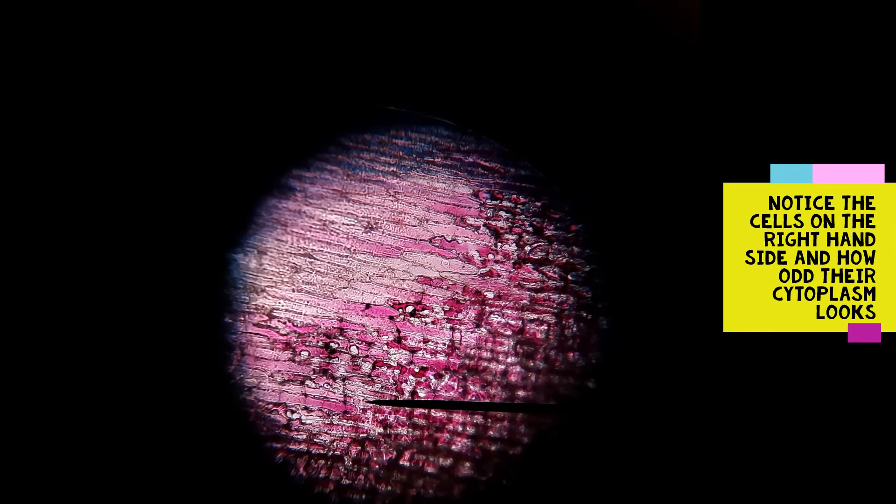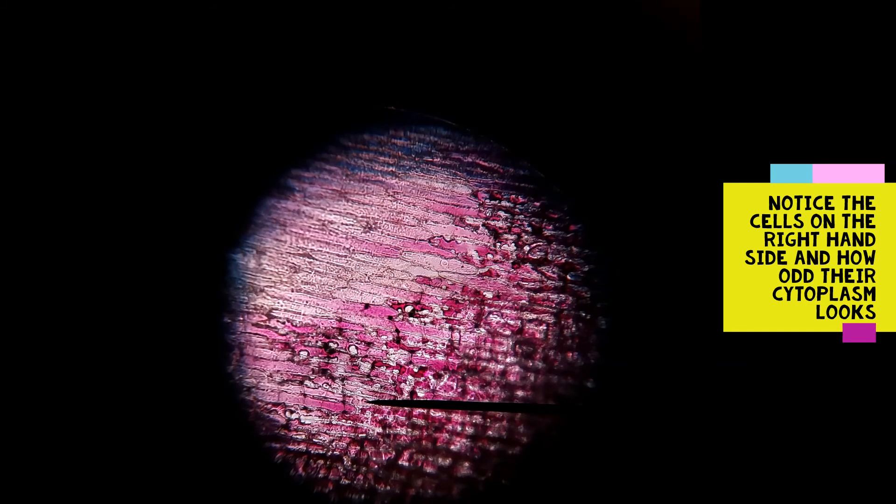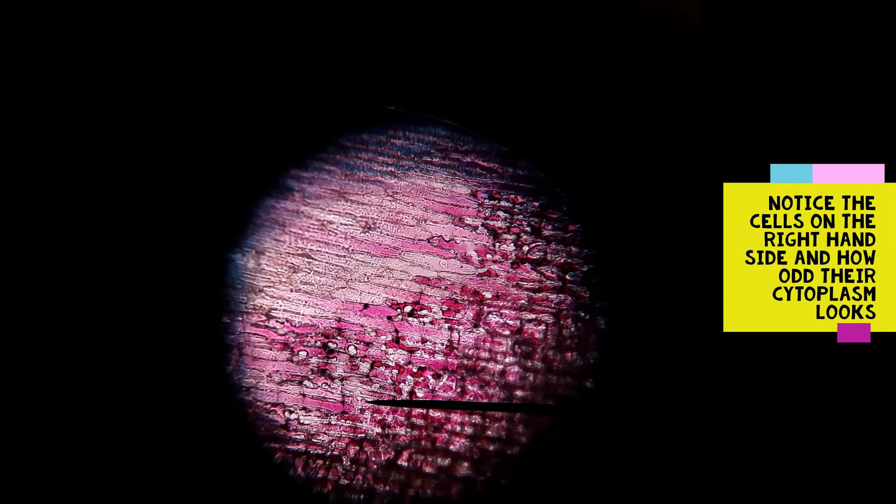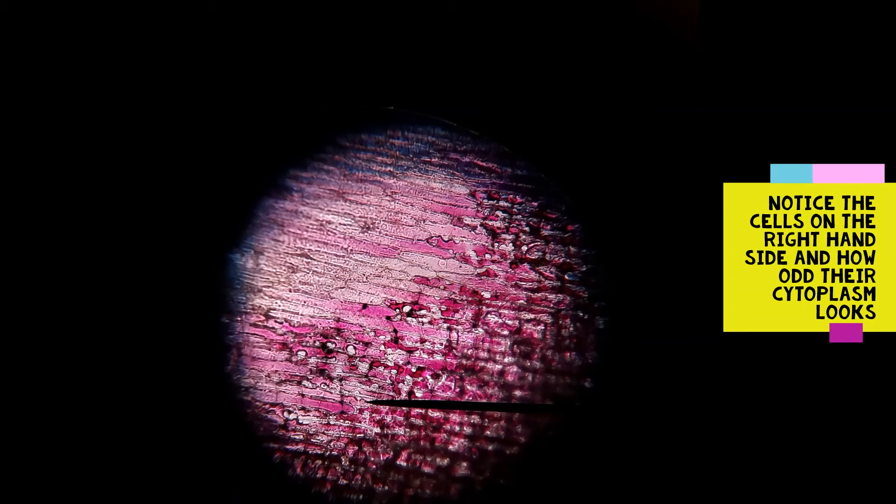So as you can see, as the salt water makes its way across, it makes all the cells along the way become more plasmolyzed. So you can see these white bits starting to reappear.